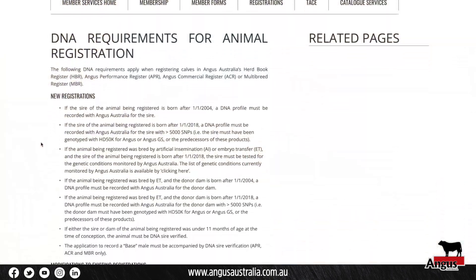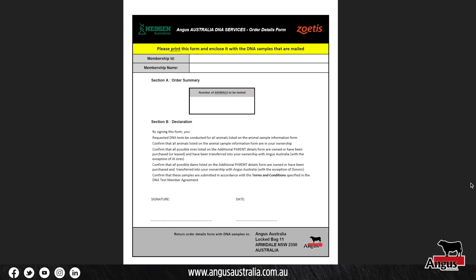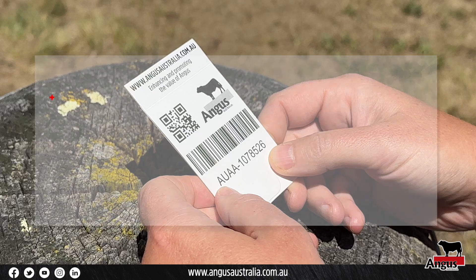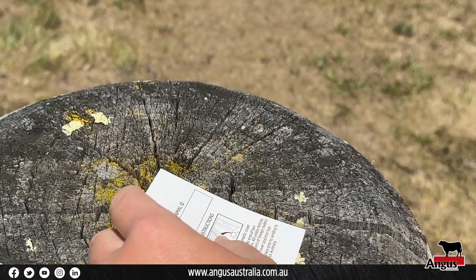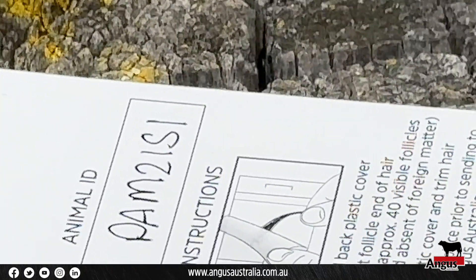You will also need a DNA test request form available from Angus Australia. Verify the identity of the animal and ensure that it is clearly recorded on the collection card. Be sure that the correct sample corresponding to that animal is placed in that card.